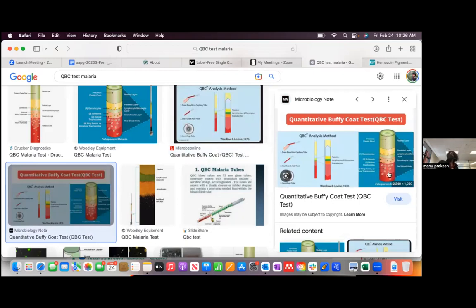You can see all of this would have collapsed into one single thin line, and you don't have the resolution to spread it. What this little bobber does is it takes, because imagine the volume of blood between this plastic piece and the outside capillary is actually very small. And so if you take that volume and you put it just in the capillary, it will all collapse to a tiny little point. So what it's doing is just increasing your centrifugation resolution. It's a pretty clever idea.